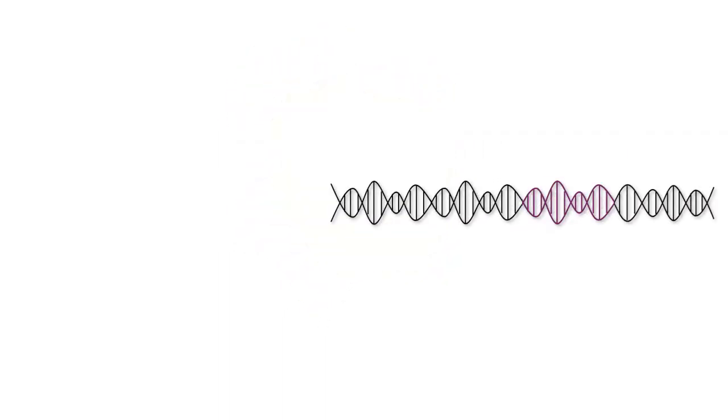One of the most frequently used processes in biotechnology is that of making recombinant DNA molecules. We saw recombinant DNA previously when considering crossing over in meiosis. And in this process, we're going to perform a similar but more directed process to produce a DNA molecule carrying a gene from another source. To do this, we'll start by removing DNA from a cell and identifying our gene of interest.